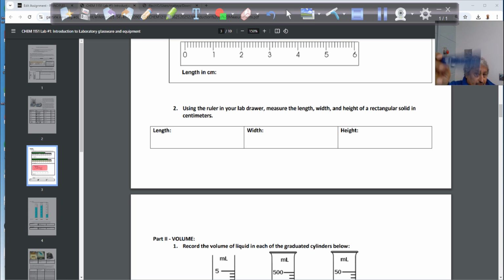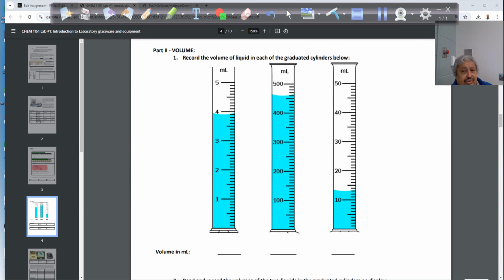After measuring those theoretical drawings there, this is the following. This is the experimental one, correct? That's number 1. Come here and then we'll do the theoretical graduated cylinder. We have 3 of those. So how much is the first one?